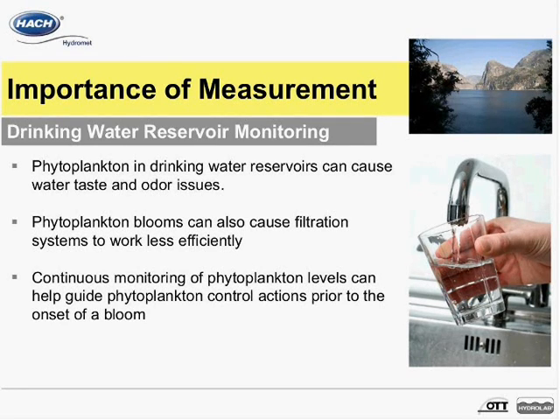Continuous monitoring of phytoplankton levels can help guide proactive water reservoir management, such as by implementing algae control methods at the first sign of an impending bloom, or by providing data to help managers determine which source water intakes to use prior to filtration.